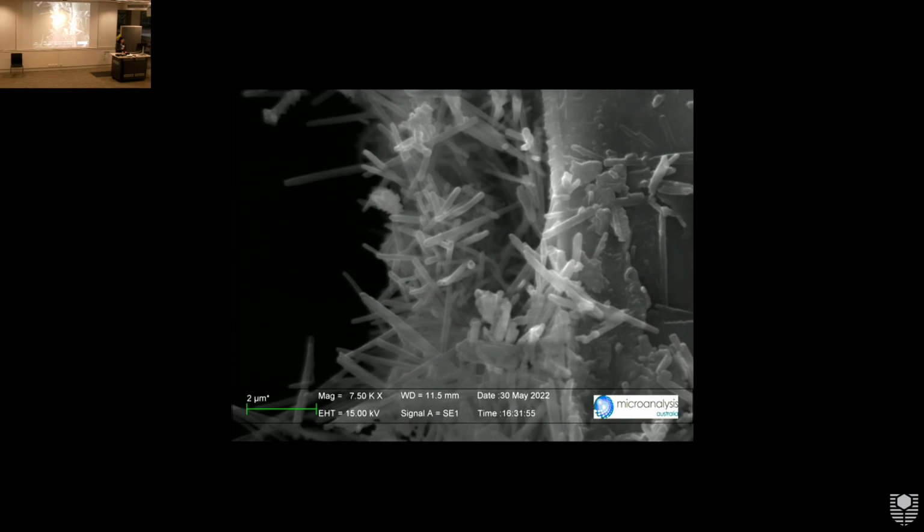Okay, so this is an SEM image of some halloysite, which I have taken, which is a nanotube structure that forms naturally from kaolin. This is the kind of thing people have been interested in. They'll send in a sample and say, is there any presence of halloysite in the sample, or is it all kaolin, and in what ratios? Because it's really hard to tell by methods such as XRD, which just goes off the crystal structure, because they have the exact same crystal structure. So then I'll spend some amount of time looking through the sample and see if I can find the presence of these nanotubes. So that's one of the cool things that we do on the SEM.